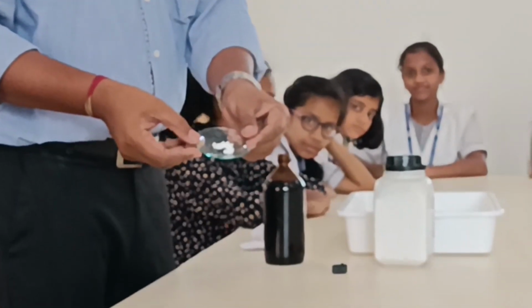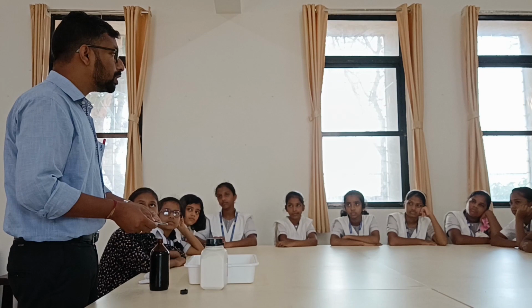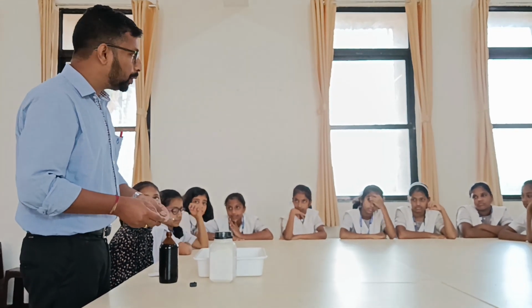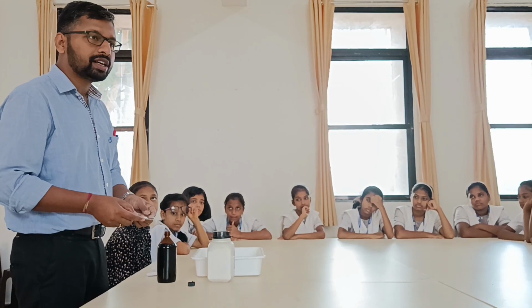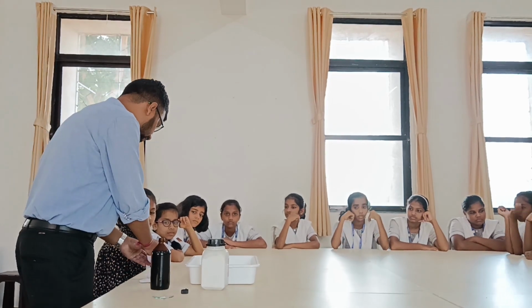Okay, fine. So, the brown colored iodine solution, if you put it on starch, turns bluish black in color. This is what we have read in the textbook also. But now we have done the experiment. Now we are sure that when we put a drop of iodine onto starch, it turns bluish black in color. Fine. Let us see the other food materials.